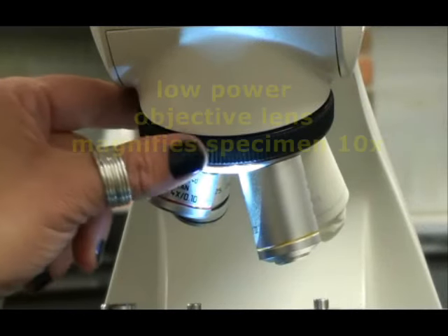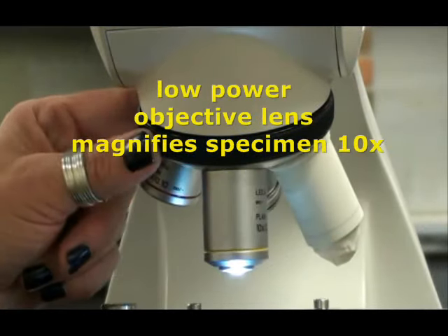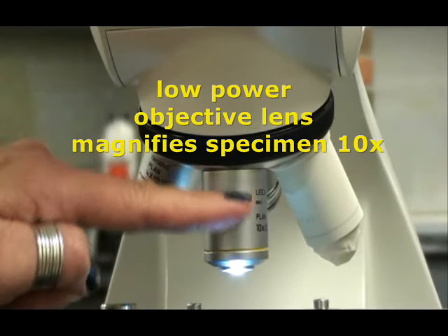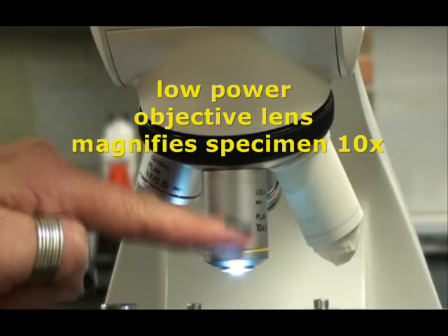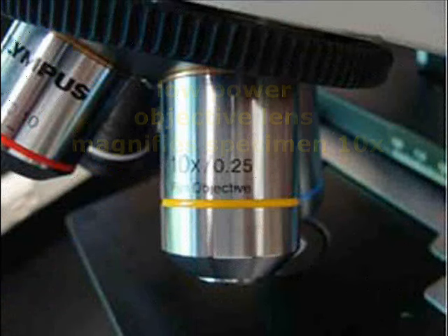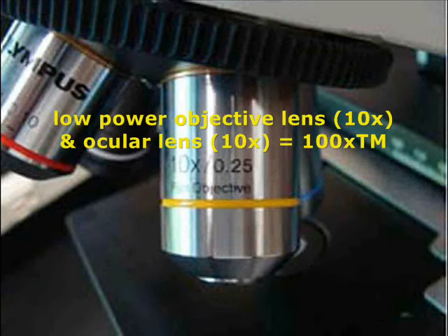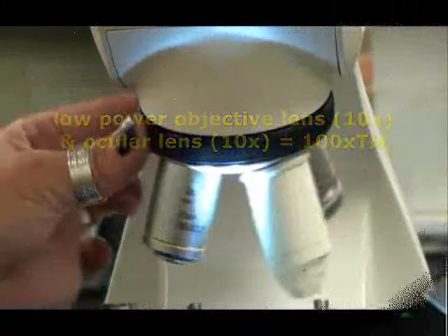The next objective lens is the low power lens. It has a yellow band around it and it magnifies objects ten times actual size. So the total magnification when using my low power lens is the ocular, which is ten times, multiplied by the low power lens, which is ten times magnification as well, for a total magnification of 100 times actual size.